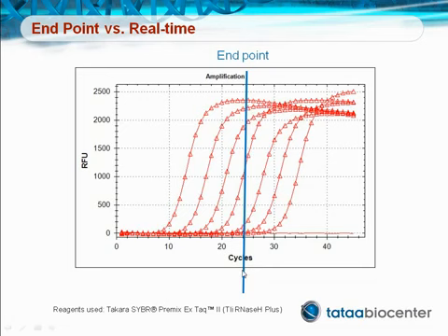as is done in legacy PCR, for example after 24 cycles as indicated here by the vertical blue line, the signals from the initially second, third, fourth and fifth most concentrated samples are clearly separated, but we cannot distinguish the signals from the 3 most diluted samples because negligible amounts of product have been formed, nor can we distinguish the signals from the 2 most concentrated samples because here the PCR has saturated and essentially the same amounts of products have formed.